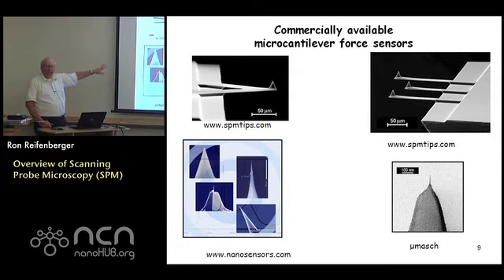But the semiconductor industry in California has all this technology to etch and make MEMS structures, these very tiny structures in silicon, and so they very eagerly jumped onto this problem. And now you can buy these tips and cantilevers for like $20, $25 a piece. And you typically go through 1 or 2 cantilevers a day if you're scanning a substrate.